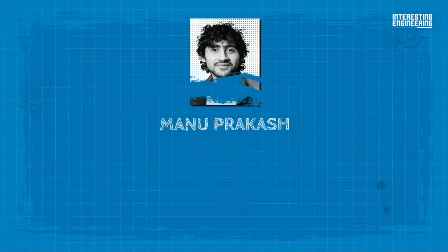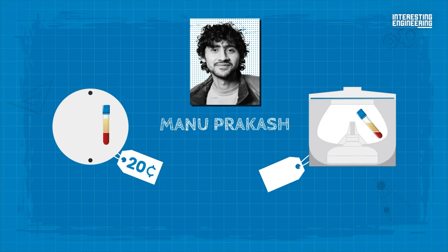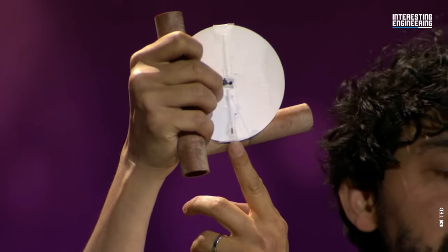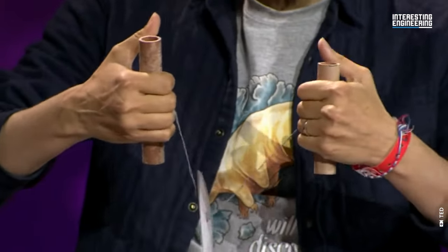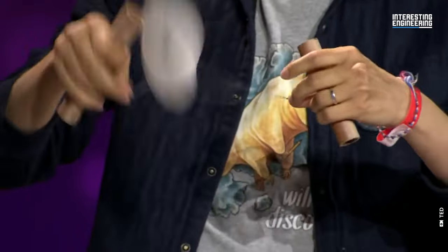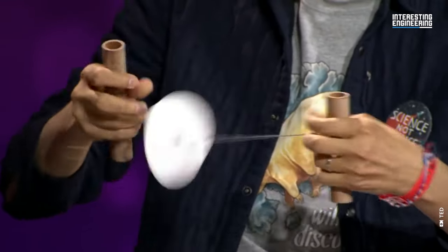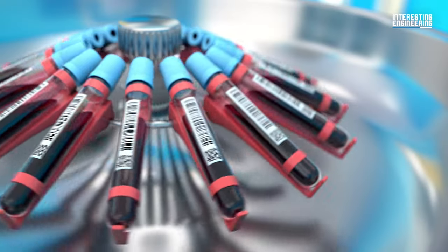Prakash said that the technical specifications of their 20-cent paper centrifuge can match centrifuges that cost up to $5,000. If you focus on this, you should be able to see a separated volume. This paperfuge is able to isolate malaria parasites in 15 minutes and separate blood plasma from red cells in about a minute and a half. And best of all is the fact that it doesn't use electricity.